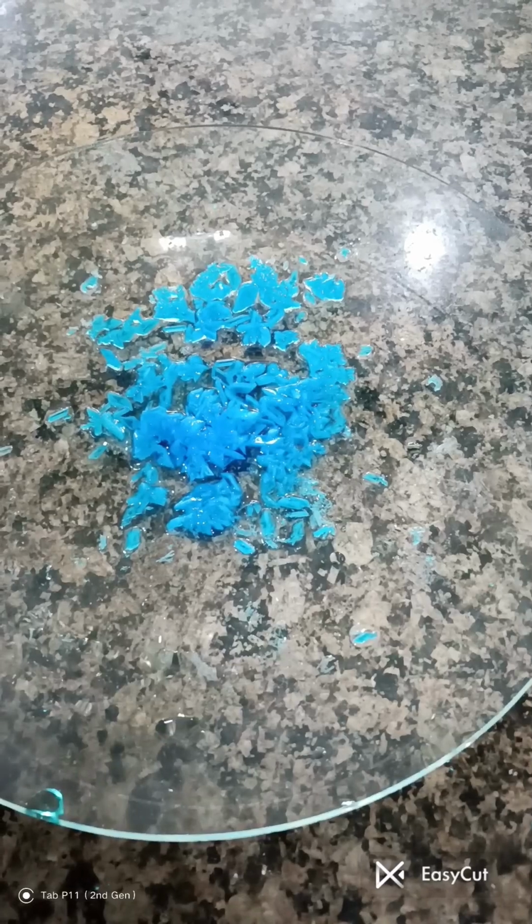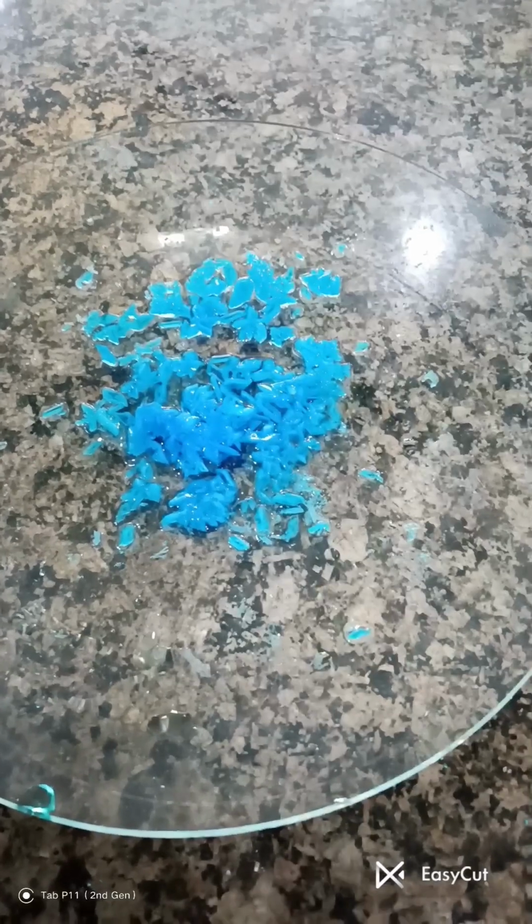Now you can check how many beautiful crystals have appeared after the cooling. When we keep this filtered solution undisturbed, the beautiful colored crystals have appeared. These crystals are of copper sulfate.